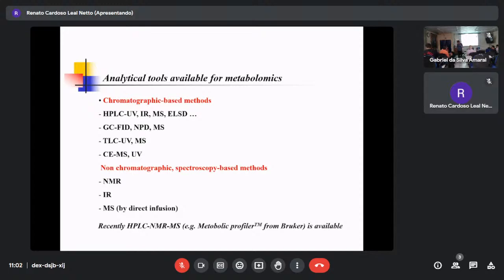The hydrogen bonding is activated in this case. So that's why a polymer type of compound, a polymer conjugated with a small molecule, they are activated. NIR also is possible because any kind of sample that has a polymer interacting with a small molecule, NIR is also possible. But it depends on the target.